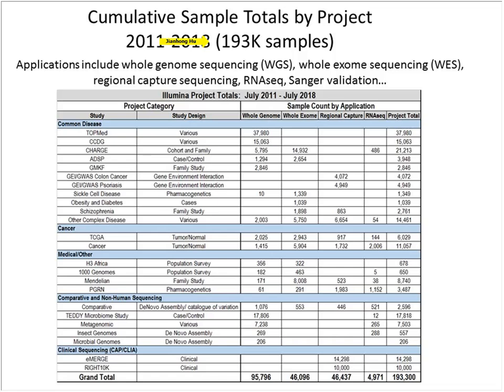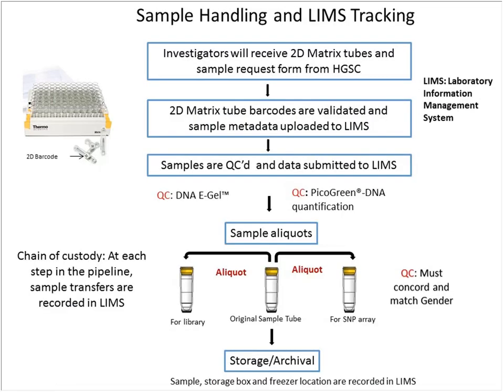samples. So as a center with such super high throughput, to check the samples and also to quality control the samples is very, very critical. So how did we do that? The first thing is the LIMS. The LIMS stands for the Laboratory Information Management System.